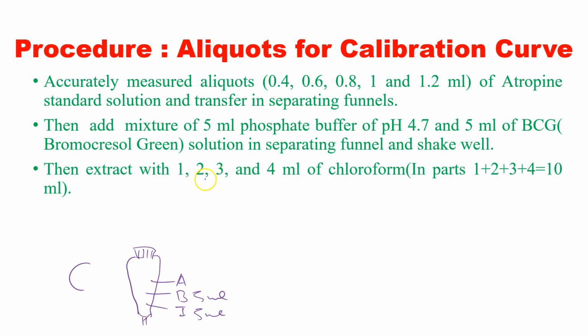you need to take chloroform. It will form a yellow color complex, which will be formed, and so we need to extract it in chloroform. Here don't confuse that with 1, 2, 3, 4 ml, because we have to add step by step. So this is a mixture.